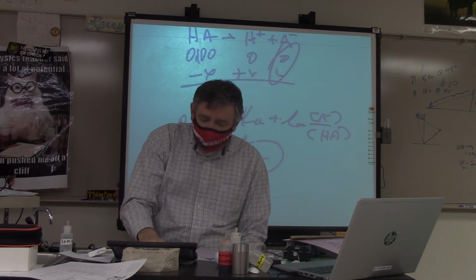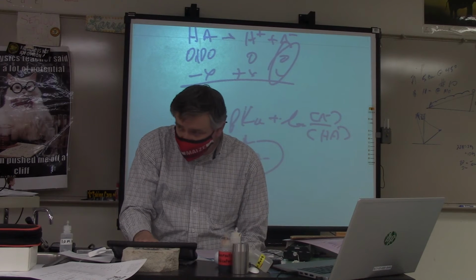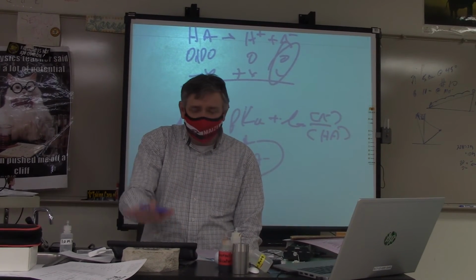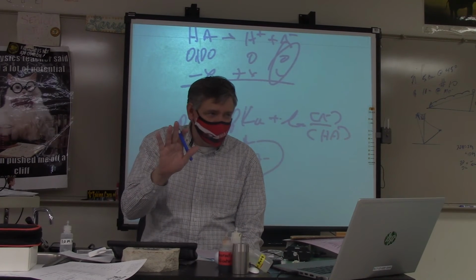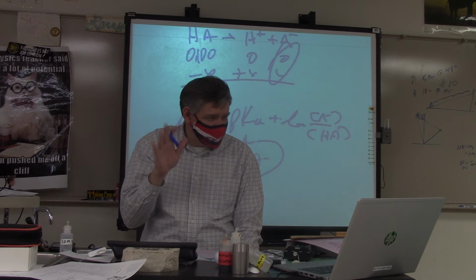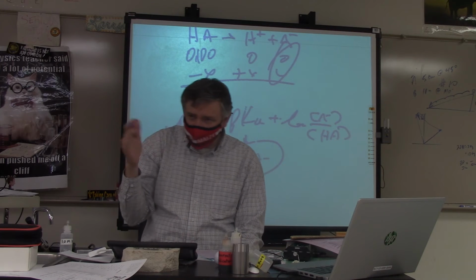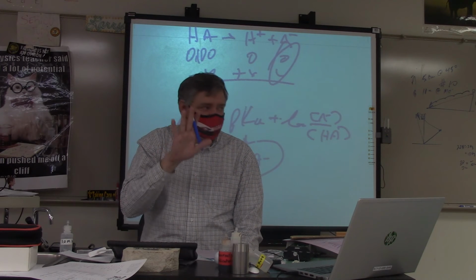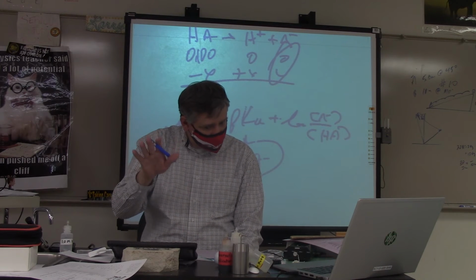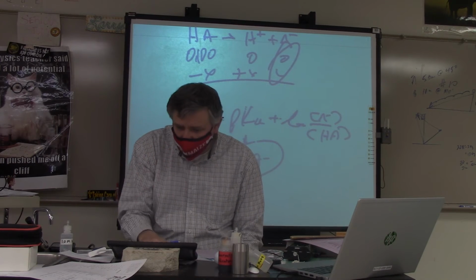So on number 11, you should see the pH go down. On number 12, you should see the pH go up, okay? So that's theoretically what should happen. And 95% of the time it goes like that, but there's a 5% of the time it doesn't. So depending upon, maybe you have some residue in your beaker or the water that's coming out of the DI system, that's theoretically what should happen, okay? Just saying. Okay, other than that, you are on your own.